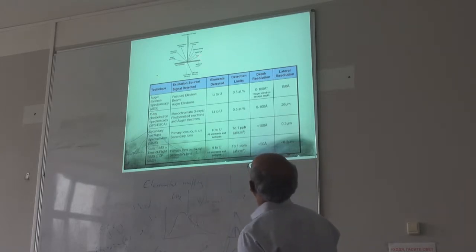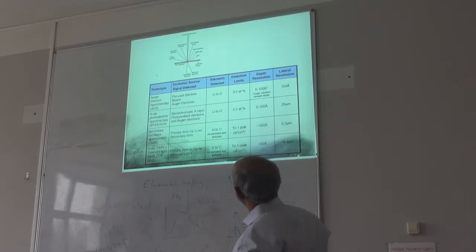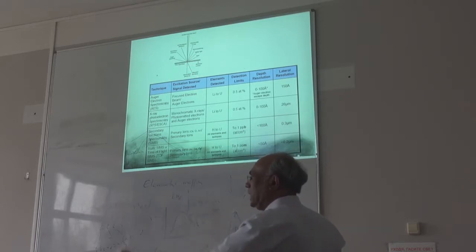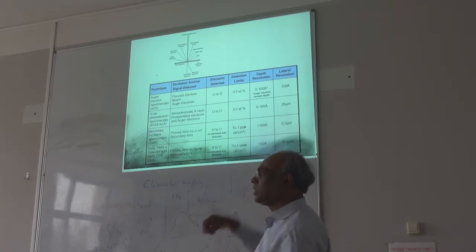Then you can sometimes have fluorescence, like visible light. Then you have backscattered electrons. Then transmitted electrons, the zero loss electrons. Then you have elastically scattered or inelastically scattered electrons. Also you can produce heat, that's a phonon. Then you have Auger electrons. I don't know if people are familiar with Auger. It's a secondary electron, for light elements.